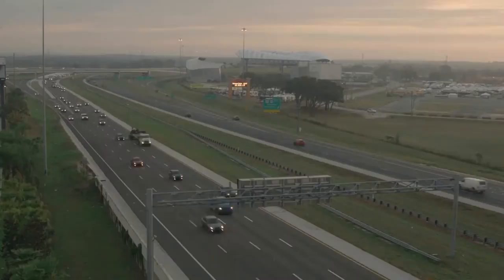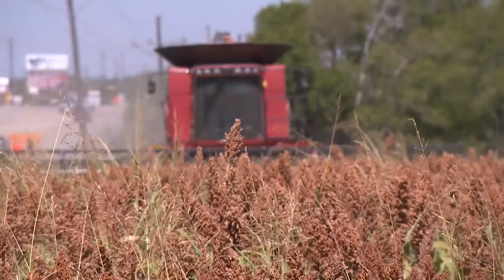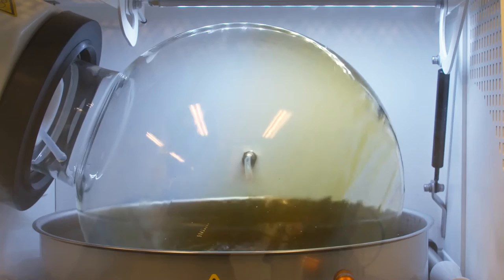Every day, the landscape of science and technology continues to evolve, bringing with it new advancements. As the legal medical cannabis scene progresses, the latest developments in machinery are being used to create the next generation of high-purity cannabis extracts.